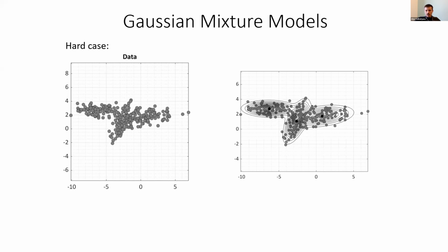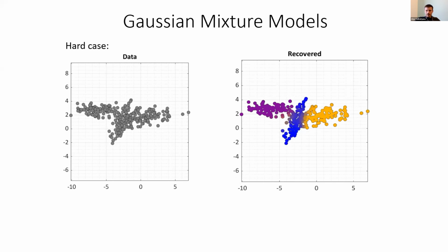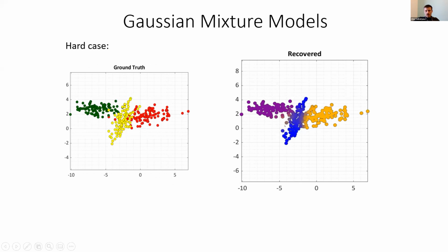And as you can see, it still models the data pretty well, to the point that the system can tell when the data is mixed up. For example, the two red points on the left side that are beyond the middle cluster are still assigned some probability of belonging to the rightmost cluster. This is one of the nice things about this method: for each point, you get a probability of belonging to each of the clusters.